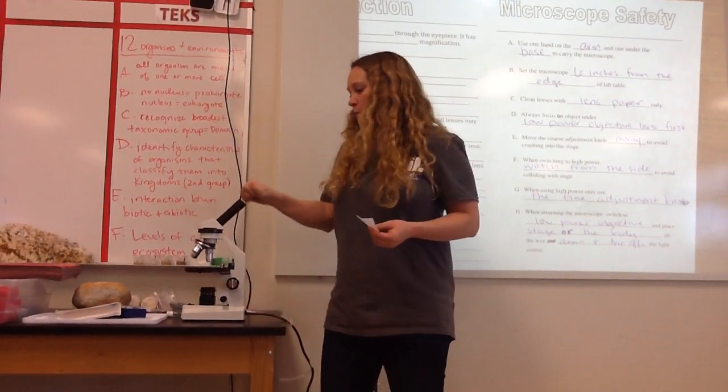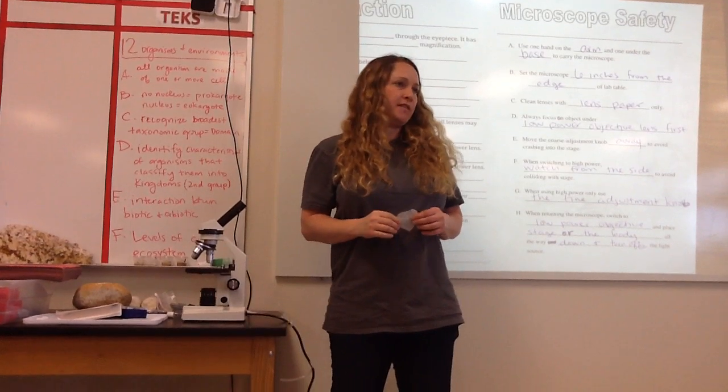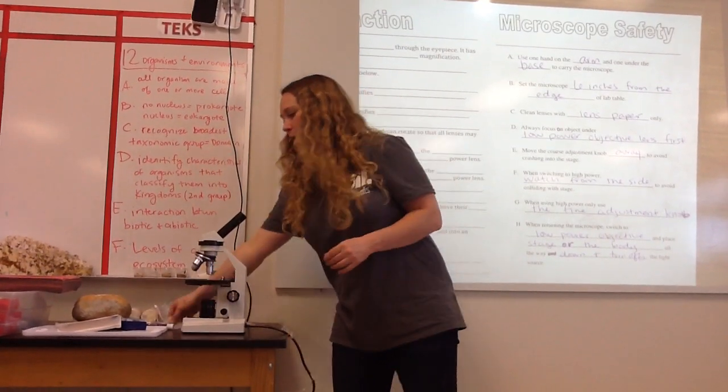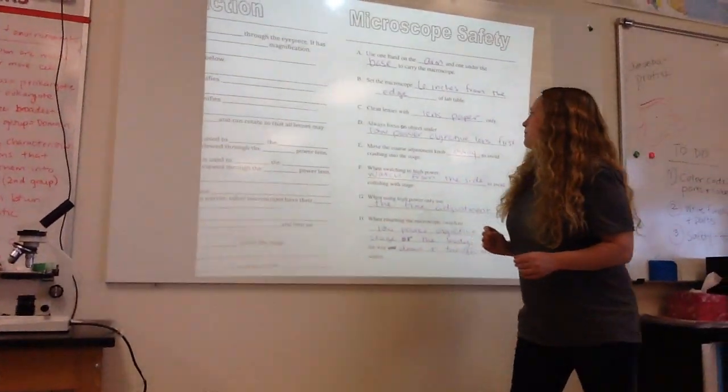T-shirt, licking your thumb and wiping it off. That's never going to happen. If I see that, I might have a science teacher breakdown. Okay? So, lens paper. All right, next thing.